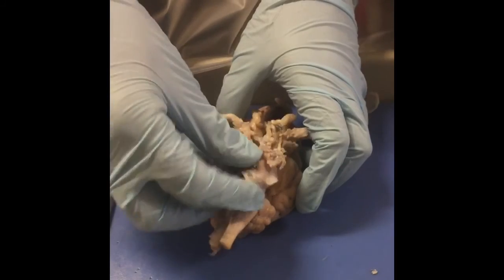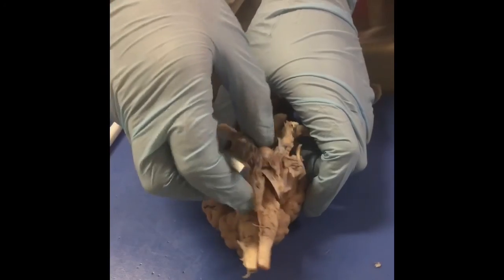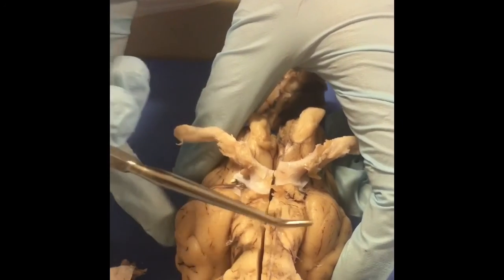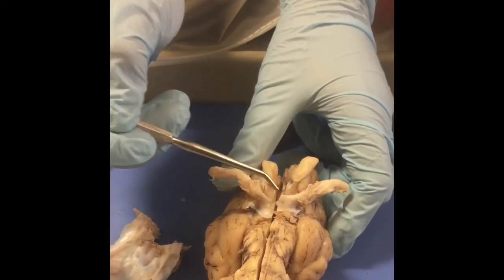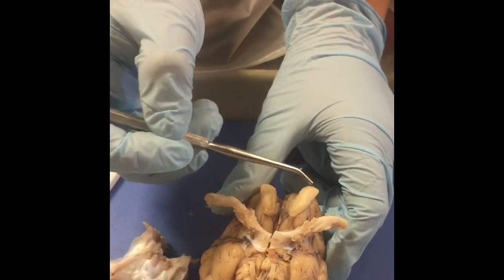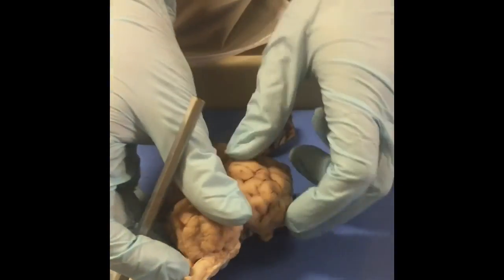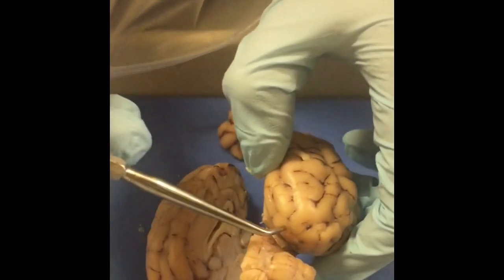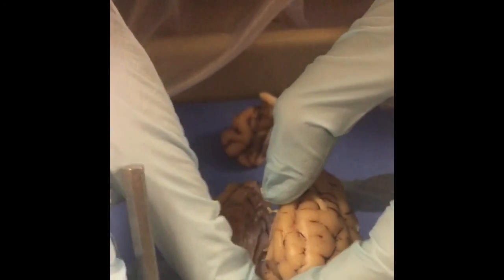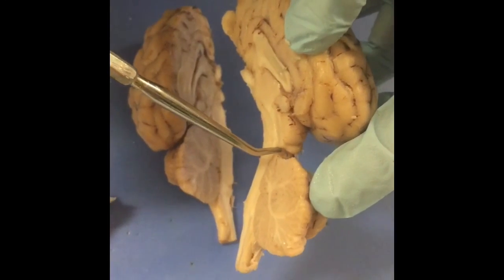And then on the bottom of the brain, we have the pituitary gland, which is connected by the infundibulum, which is this little piece right here. And then the two optic nerves, which are connected by the optic chiasm. And then we have the olfactory bulbs, which stick out right here. And then if you look in between the cerebrum and the cerebellum, we have the superior colliculi and then the inferior colliculi.